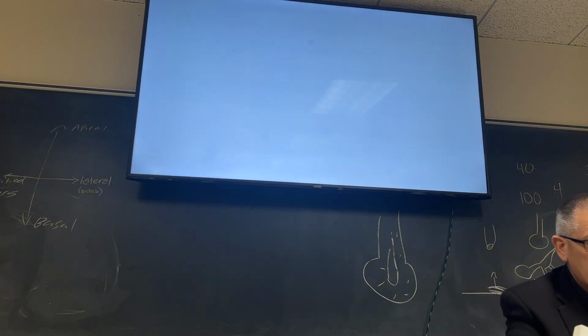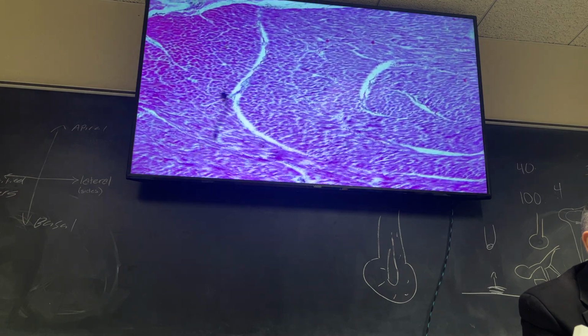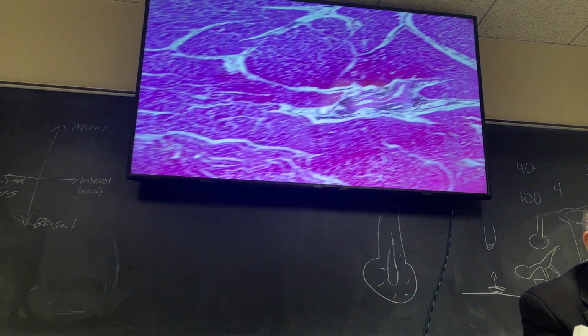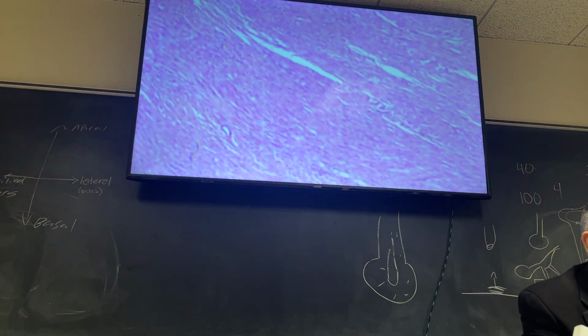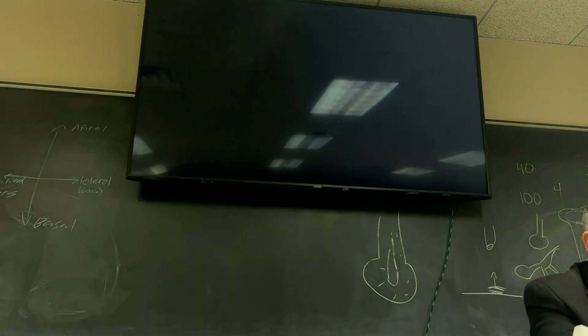All right, what's next? Cardiac muscle. Heart. Okay, let's look at some heart muscle. Let's see, how about this one? It's okay. Don't love it. Let's see what else we got. How about this one? That's better. Okay. So this is muscle cardiac section is what it's called.